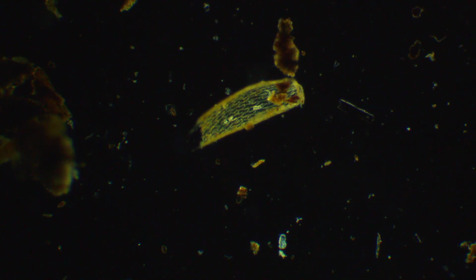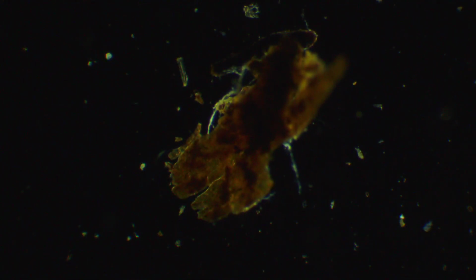Some nice plant material. Look at those cells. Look at the way they're arranged. That is nice. It's really nice. It's a neat pattern. It's all interwoven together. It's squished together. It's pretty cool. Some kind of woody looking material. I think it's like a kind of peaty material. That looks like another little tiny egg. Not a whole lot in this section.